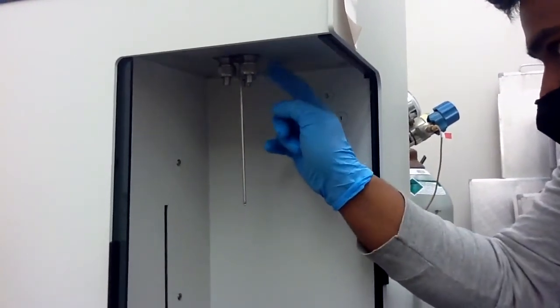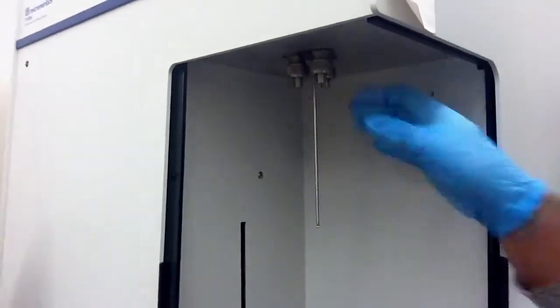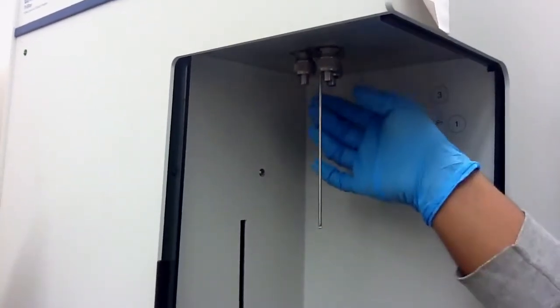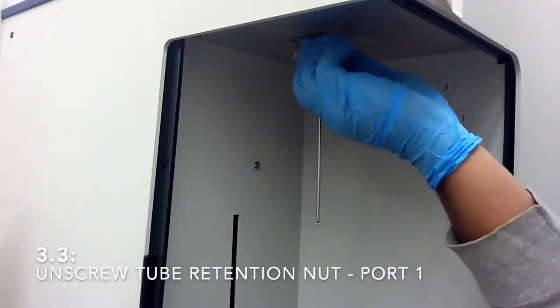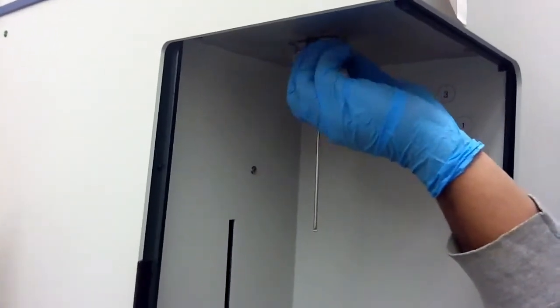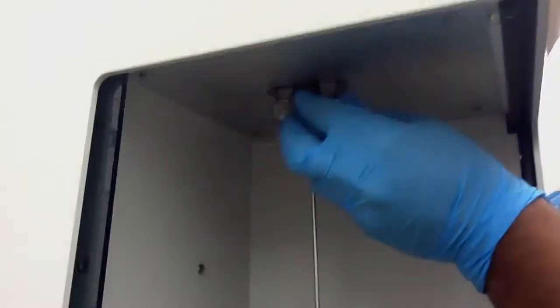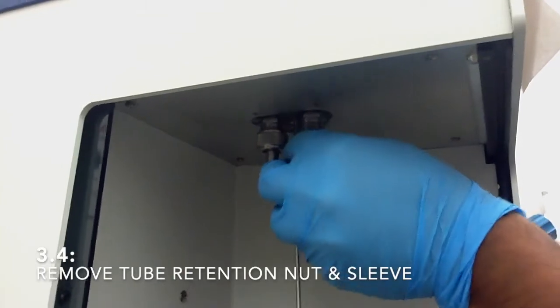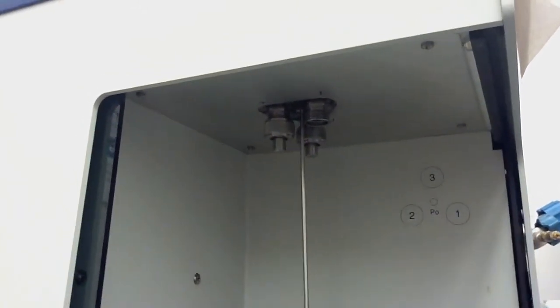This one is port number 3, this is port number 2, this is port number 1. These are all now closed. What you have to do is remove this port. Suppose I am removing port number 1. All you have to do is take this nut, take it out from this, and there will also be one ring inside of this.